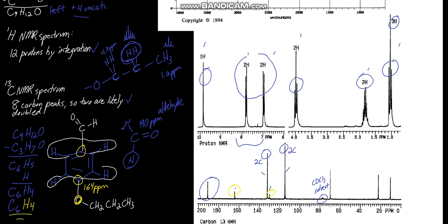The other thing you want to keep an eye on are the extra tall carbons, the extra short carbons, obvious signals like a methyl group. You want to also weigh heavily on where carbonyl carbons are in the carbon NMR, associated signals like that, aldehyde proton, or if it was a carboxylic acid, you would see a carboxylic acid proton, very characteristic, very deshielded, 10 to 13 ppm, and broad, things like that.